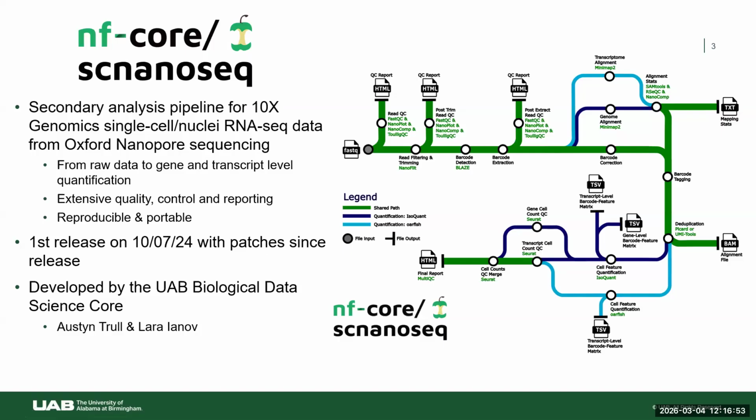For those of you who may not have realized, it's very common in secondary analysis of 10x data that even though we have a cell barcode list that always gets checked against a whitelist, there's a chance that some specific nucleotides in those cell barcodes are incorrect, which may be due to sequencing errors. So the workflow allows you to correct for that, as long as there is a small probability that it is truly fully incorrect. We allow for that to a degree.